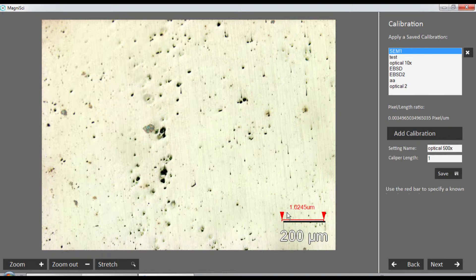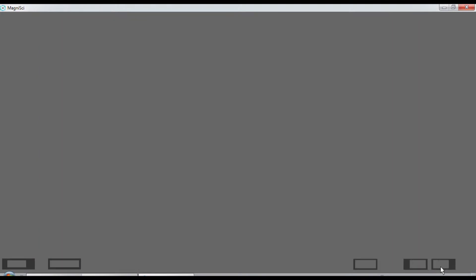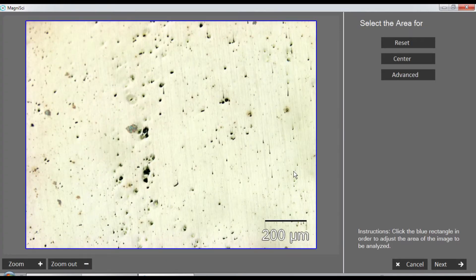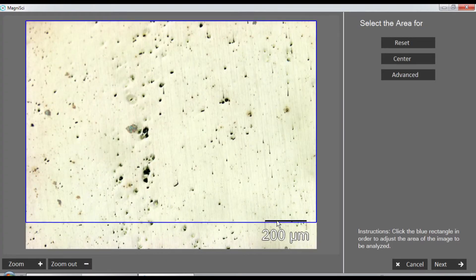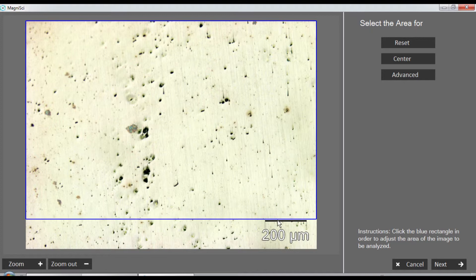Doing the calibration on this image would limit the field of view because we have to cut that part out of the image. I call that 200x, save this, and choose that calibration for my image analysis. Now we have to select the area for analysis - I'm going to get rid of this particular feature right above the line, then say next.